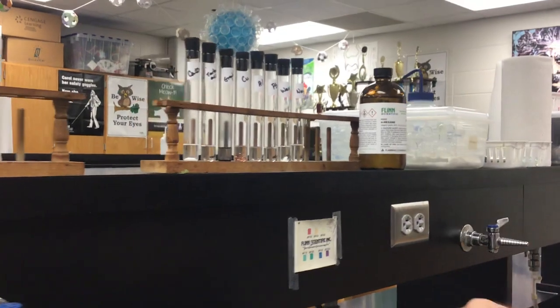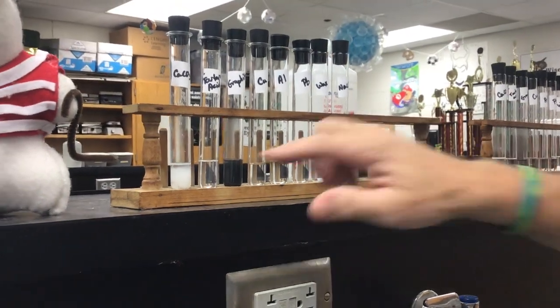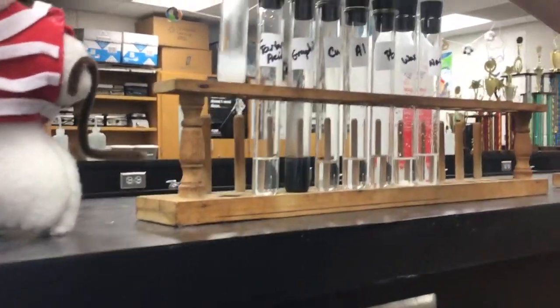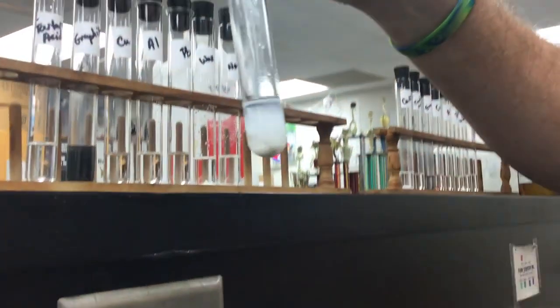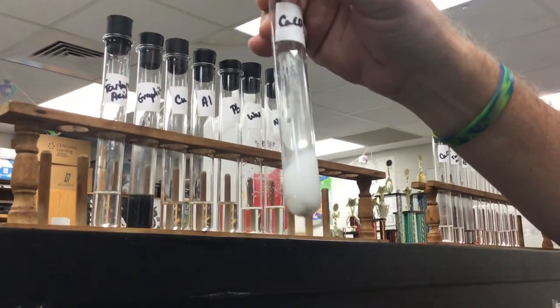So let's go back and look at those after they sat. It hasn't been very long, but we're looking to see if there are precipitates. In other words, did they dissolve in there? We're still seeing something left. And if we look at the calcium carbonate, you kind of see the separation there. We've still got solid on the bottom. You know, take your observations. What do you think? Did that dissolve in the isopropyl or not?